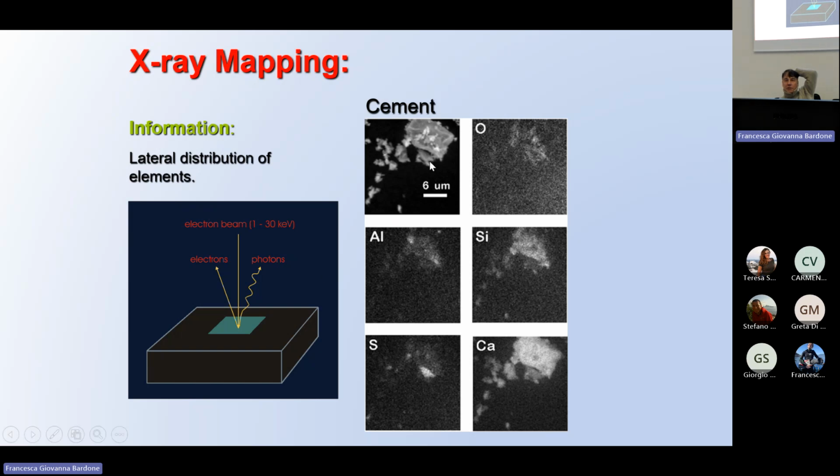Well, the first image on the top left, the cement. There is a particle of 20 microns by 10 microns. Not only this particle. This particle has other smaller particles on the top. Okay, let's talk about it. I did all the things I can get from this observation. So the first is the morphology, the size of the particle, whatever. The second one, okay, I put these elements.